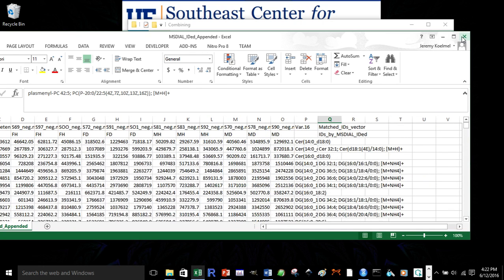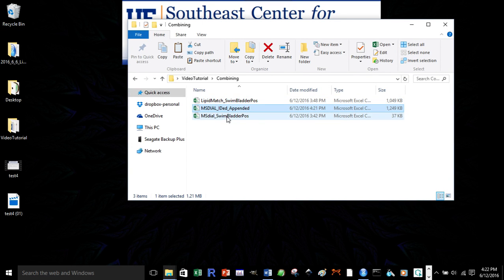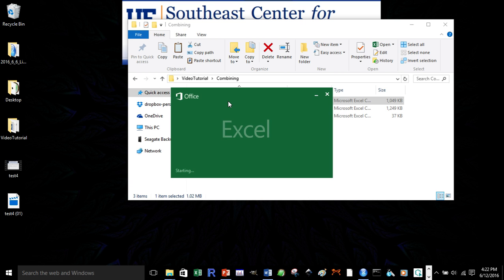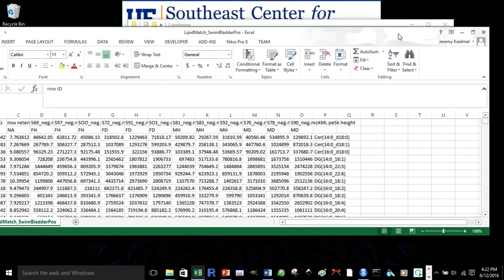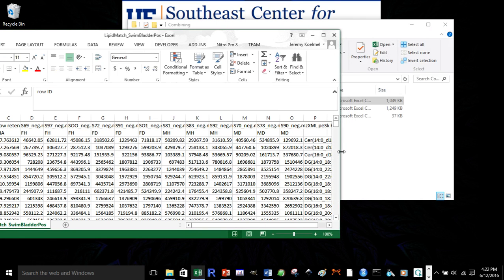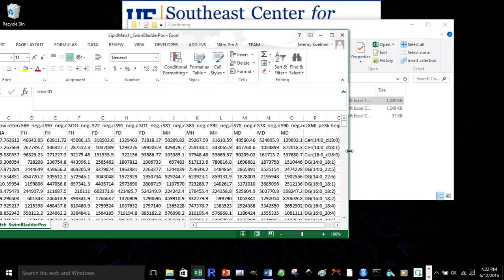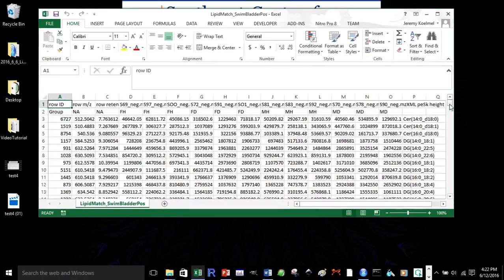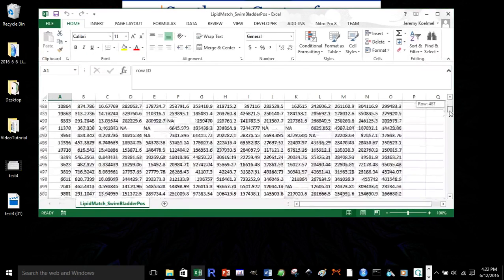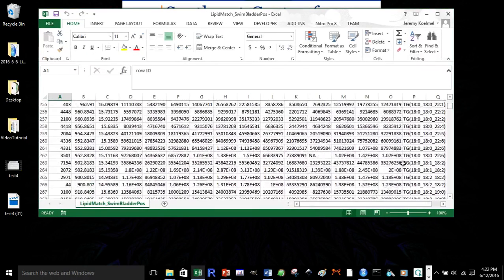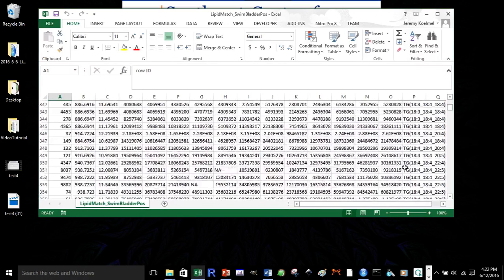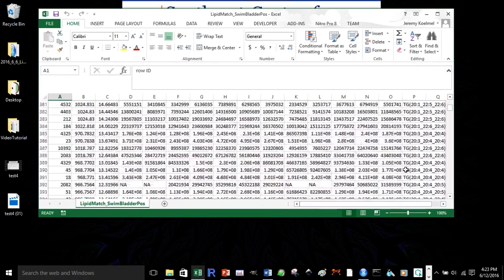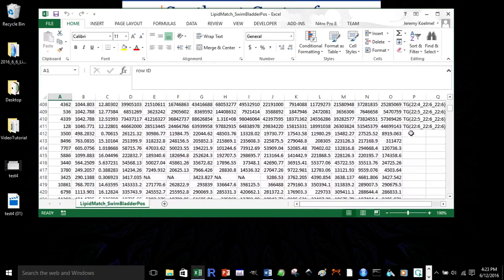So, I'm going to close this. There's one last thing I want to show, which is just a comparison of lipid match and swim bladder using the same data. In lipid match, we can see, and this is an old version of the software. Whereas, as you can see, ADDICs aren't shown, nor are the multiple confirmations. But even with the old version of the software and limited libraries, in positive ion mode, we were able to identify 411 features using lipid match.